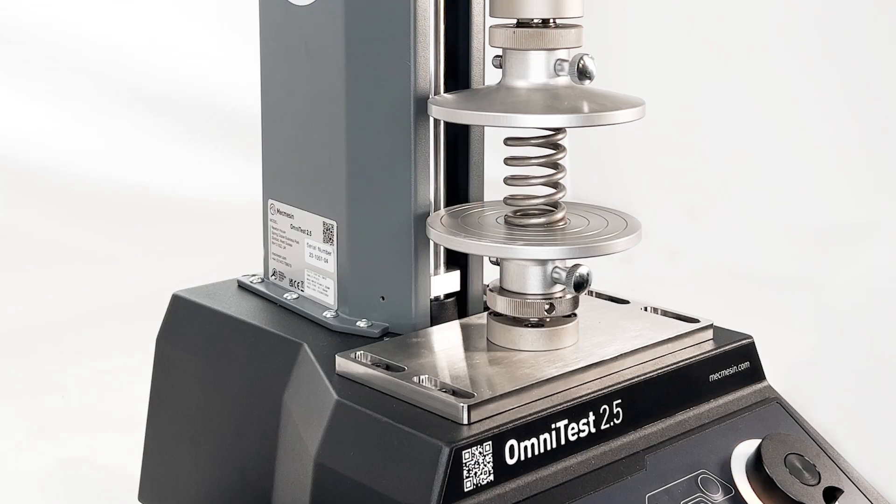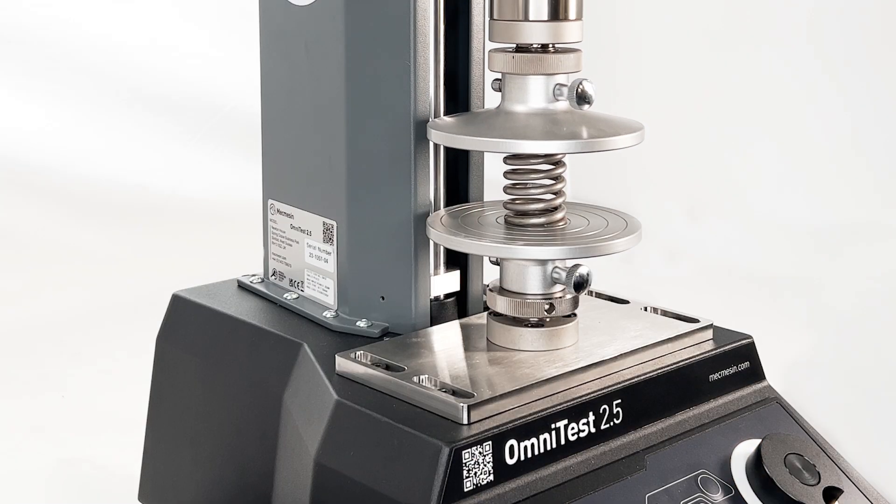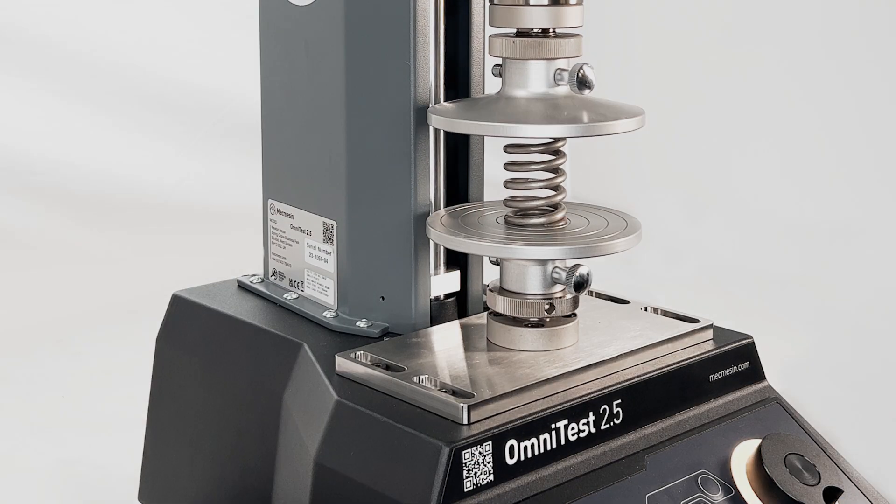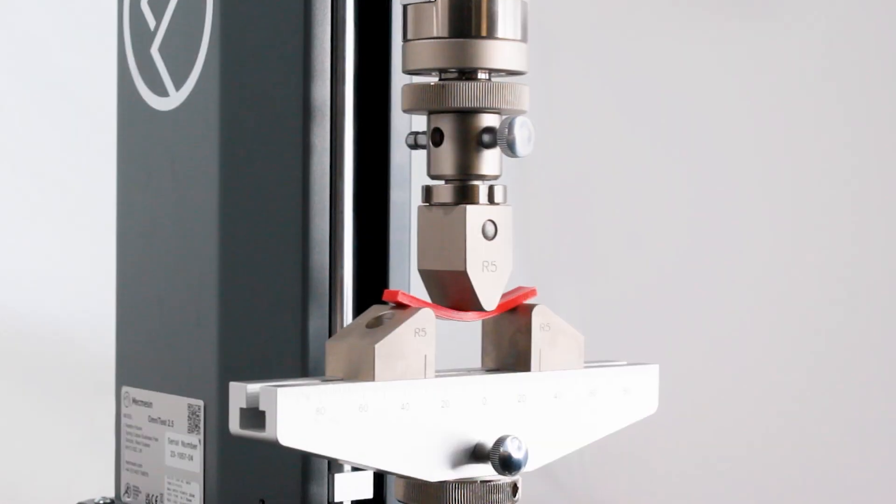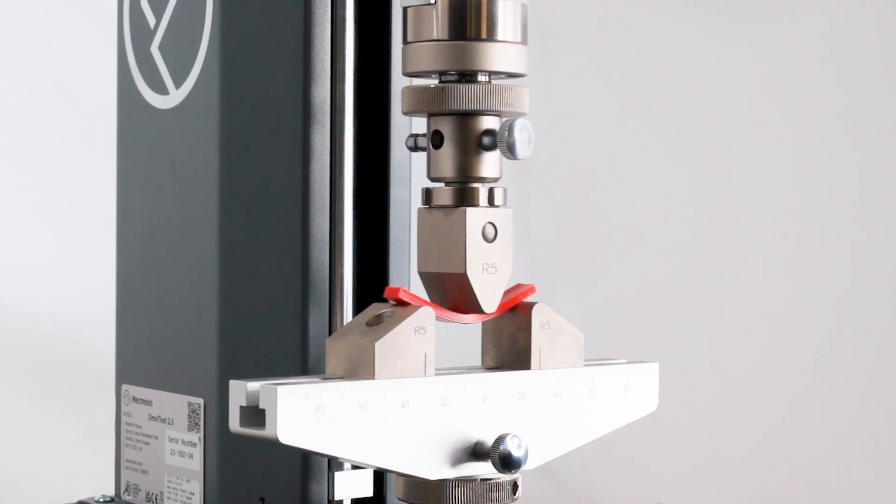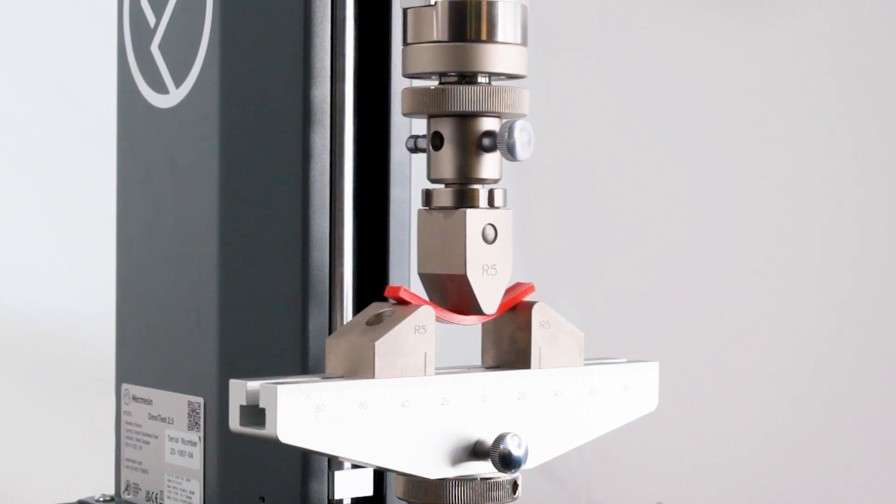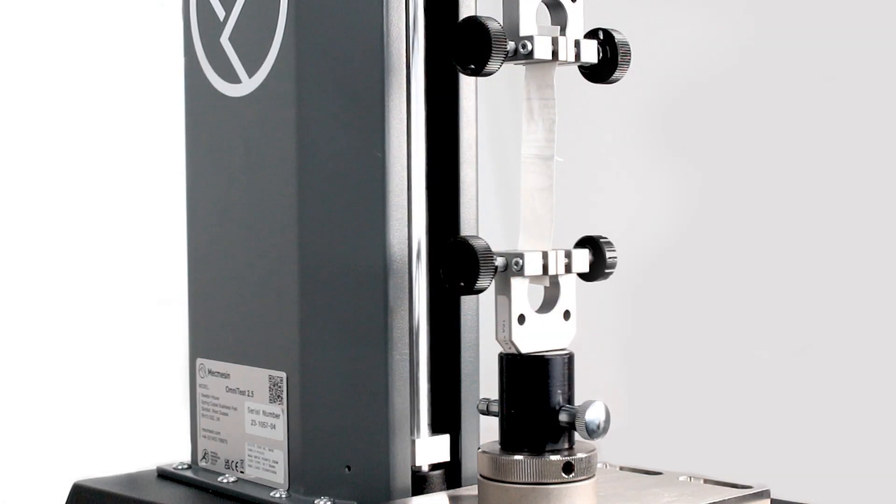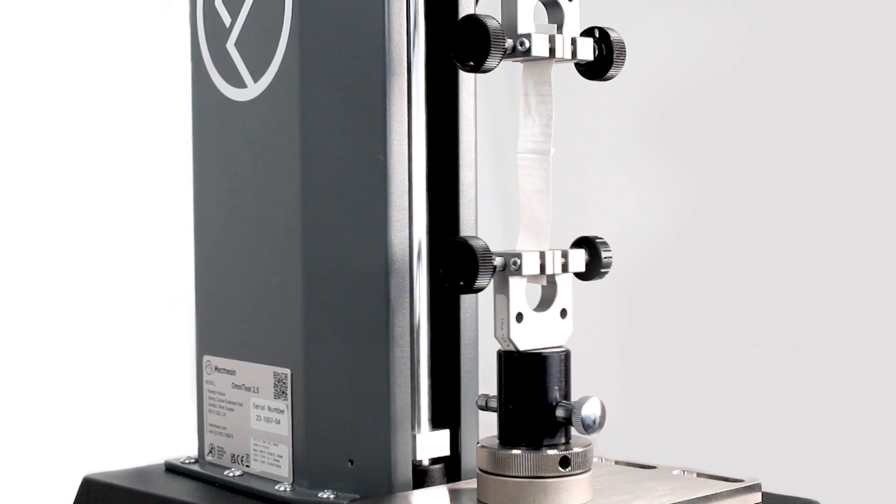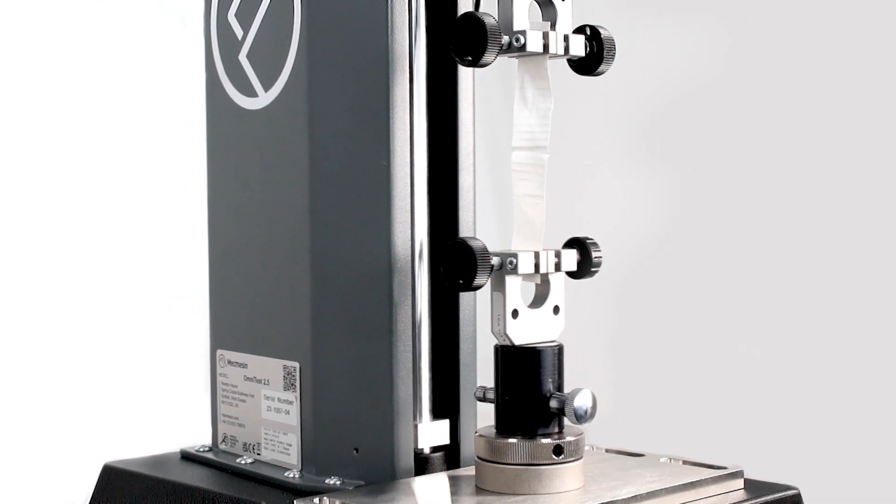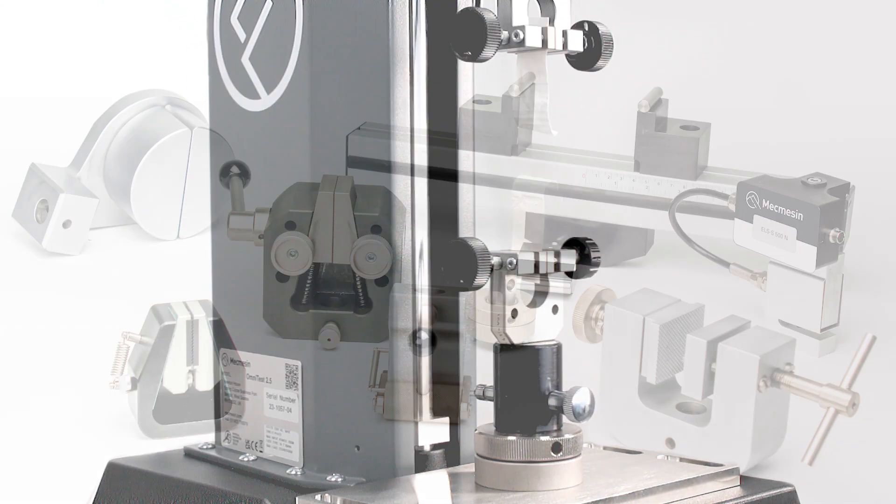The range of Omni test test frames enables the physical properties of many different materials to be accurately characterized in tension and compression, such as metals, plastics, composites, wood, fabrics, glass, and ceramics.